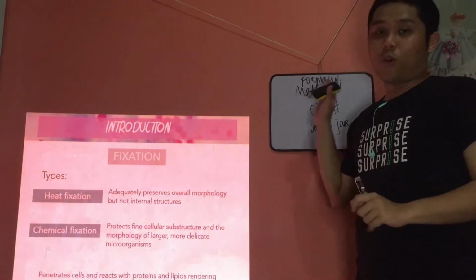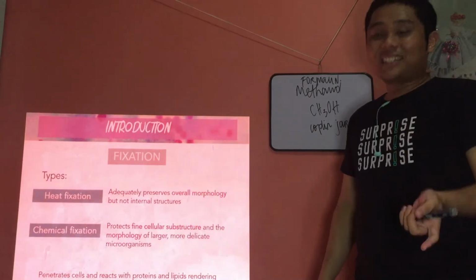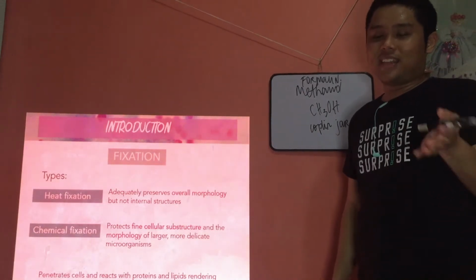Why? What's the reason? Because formalin will kill your bacteria in your pleural fluid, in this example.